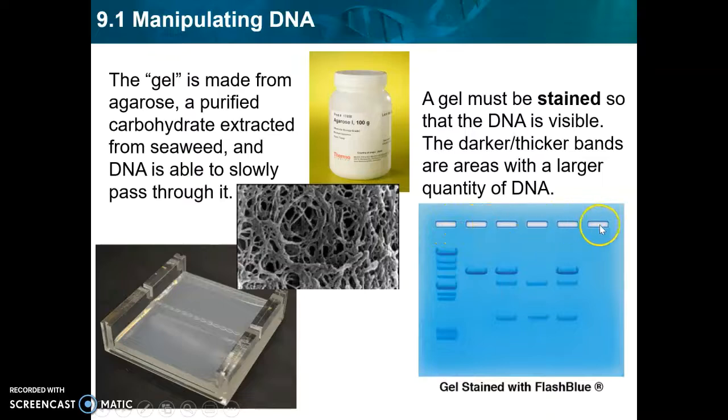And again, this is the top of the gel. That's where the DNA started. So the larger bands are going to be closer to the top. Smaller bands are going to be closer to the bottom.